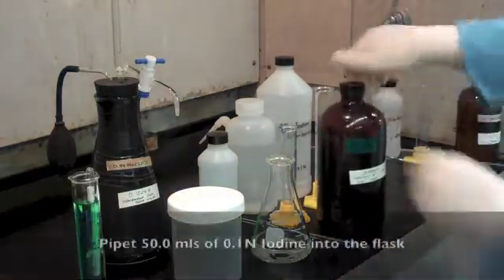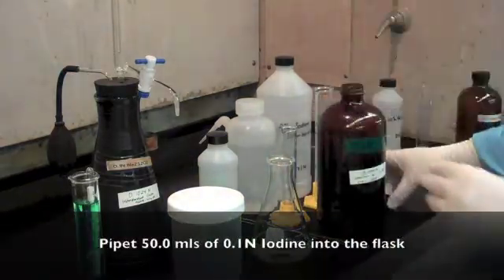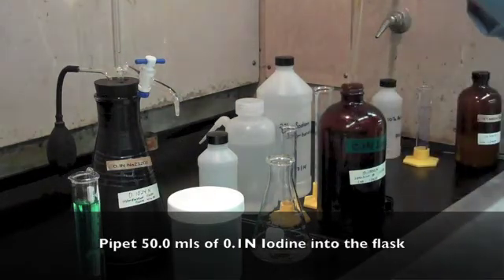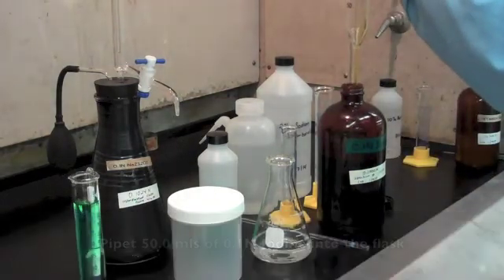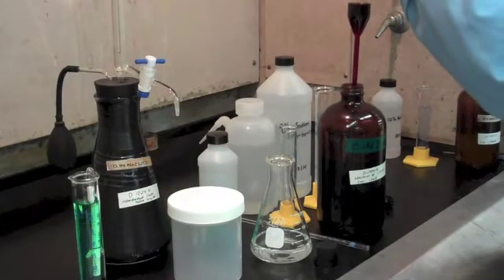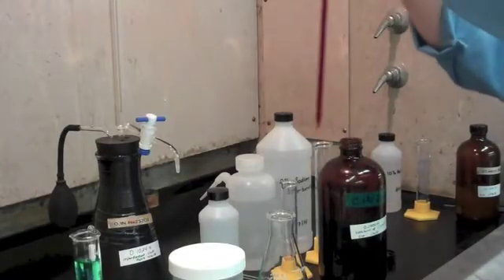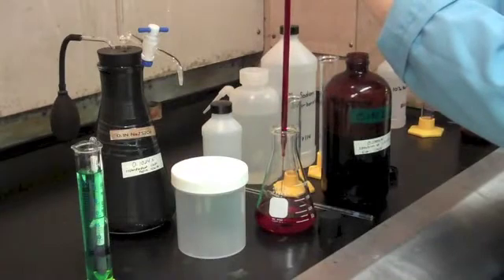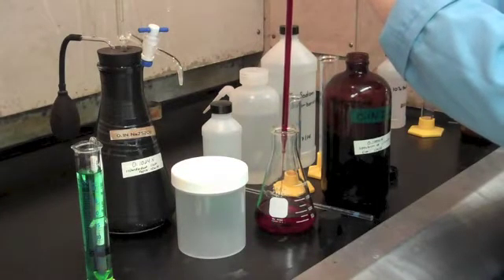Then we're going to pipette in 50 milliliters of 0.1 normal iodine. And as you can see, the solution will turn dark brown.